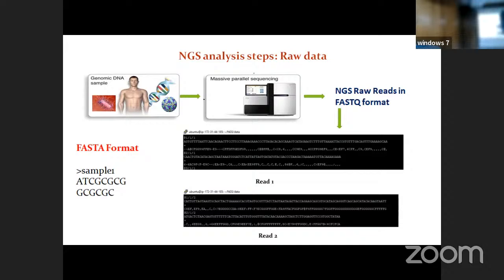In GenBank, if you are downloading data, it will be in GenBank format. So there are many sequence formats, but generally in all formats, you will get a nucleotide sequence and a simple header line.